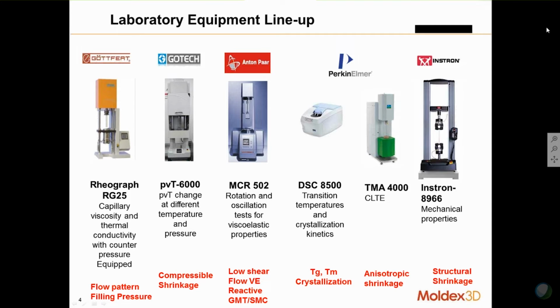And also for mechanical properties, we have this instrument. So this is a pretty cool instrument. What's so special about this instrument is that it's got the optical extensometer. So it's very precise. It relies on infrared detection.